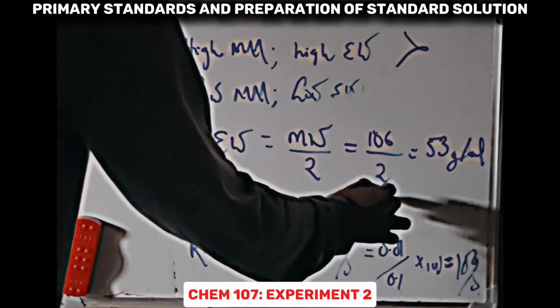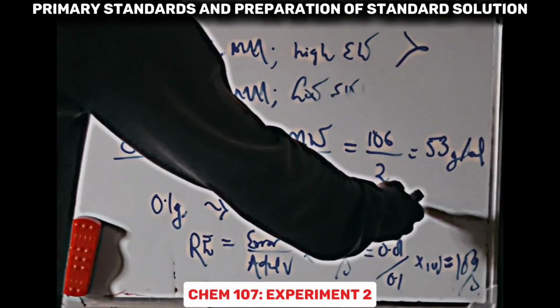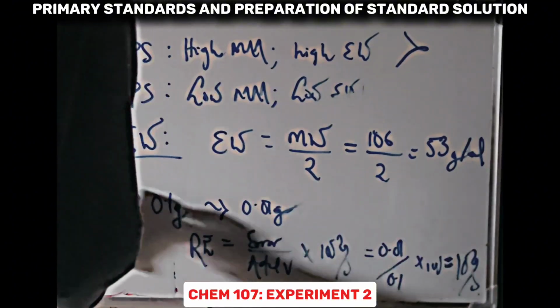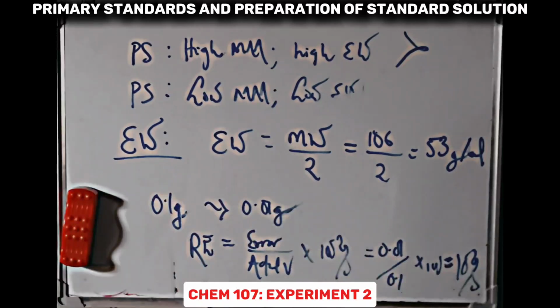What I mean by off is this: from the desired concentration using the primary standard. So you're going to have a total error that is 10% off from the actual concentration you want to determine. So this is the essence, because we have a very small low equivalent weight.